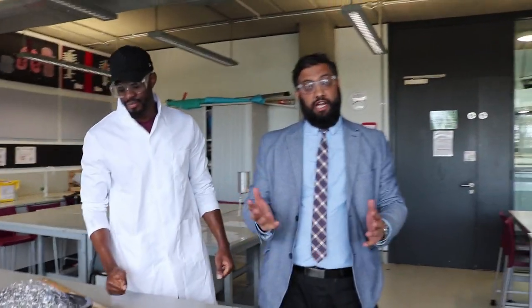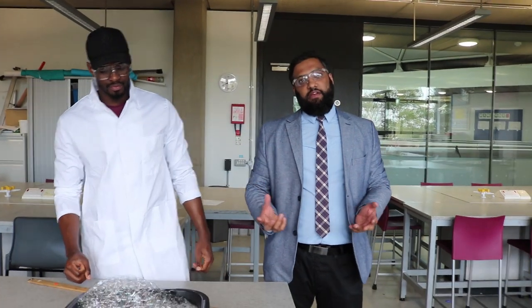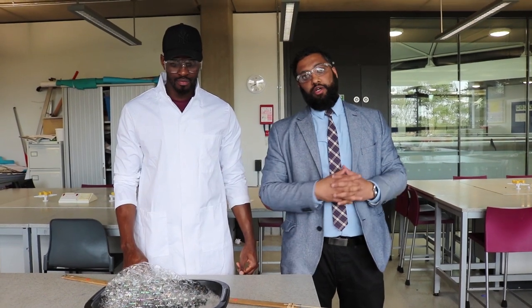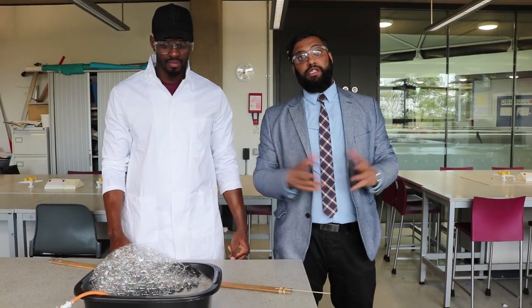Right, so what we're going to do, we're going to have a little bit of fun today. What we're going to be doing — I think most people know — it's a methane bubbles practical. Normally what we do is just have a bit of fun in our classrooms, and what we're going to be doing is lighting some methane bubbles and see what happens.